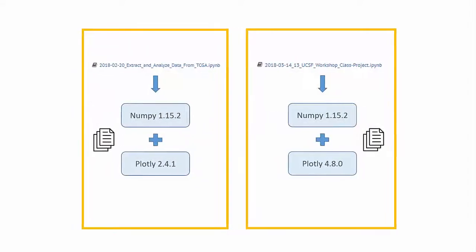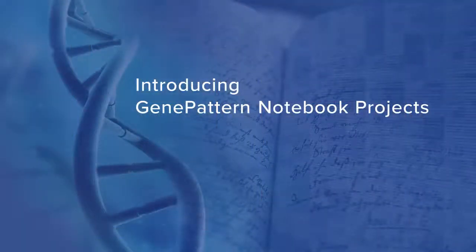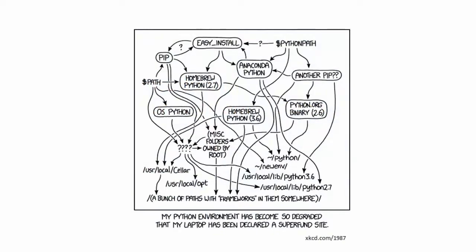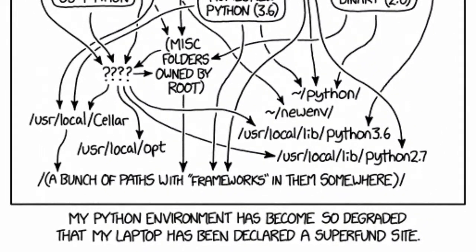Sometimes, keeping things separate is the best way to keep them together. Introducing GenePattern Notebook Projects. If you have ever updated a library, extension, or even a file in one notebook, only to find that it has now broken another notebook, this feature is for you.